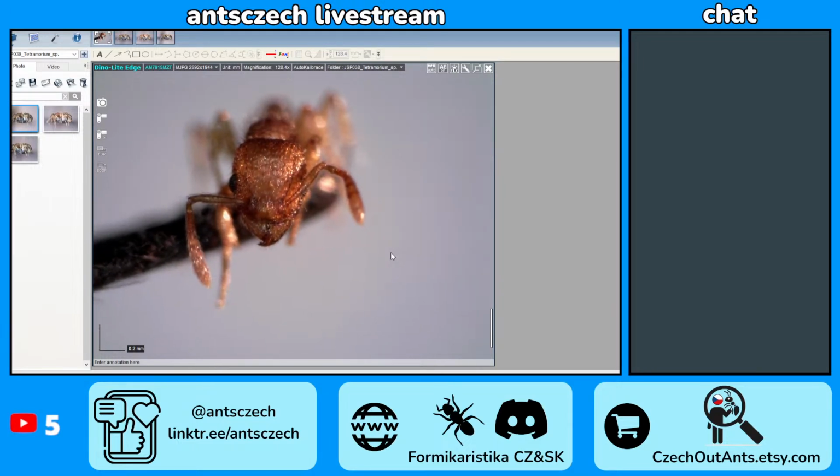I have to identify this Tetramorium, which I have a general idea that it's the, wait, Tetramorium tonganum. I mean, we have a person here in the VC who's also very good in chat. Harry, I don't have a Proceratium specimen, but I think you heard he has it.